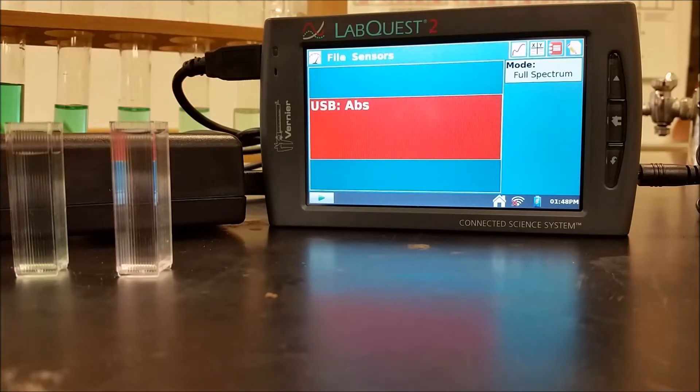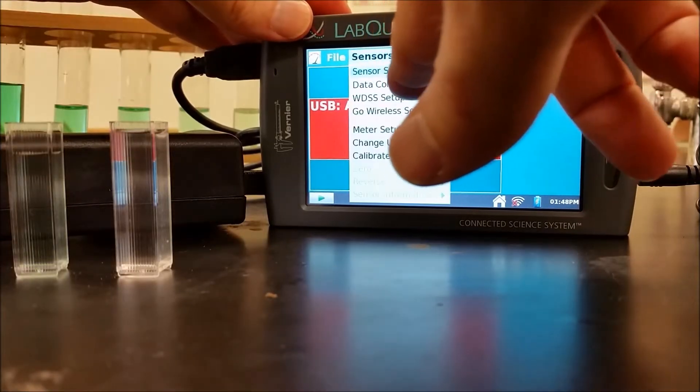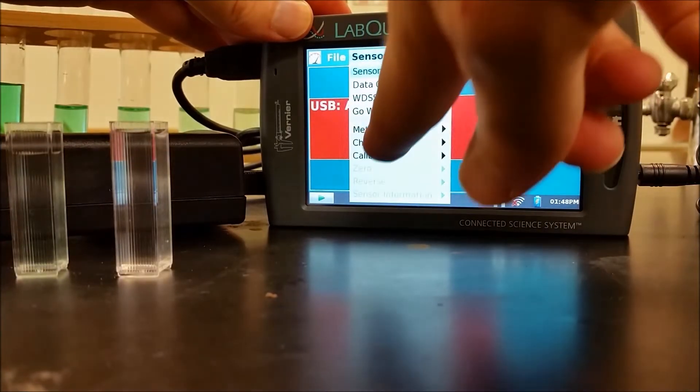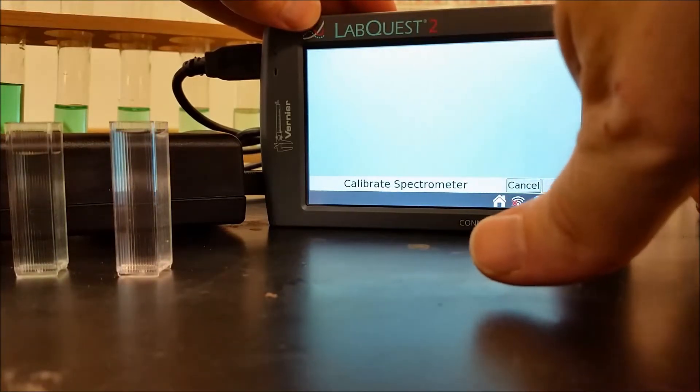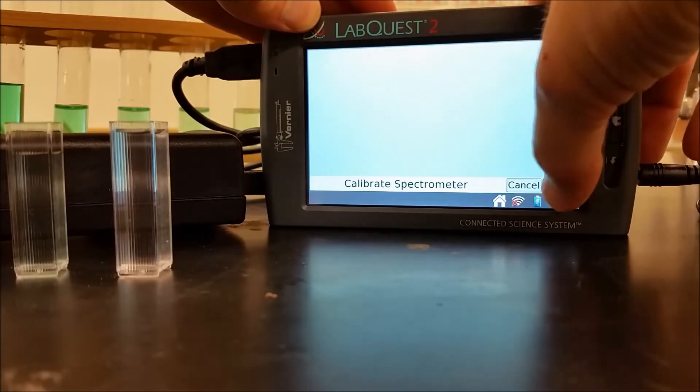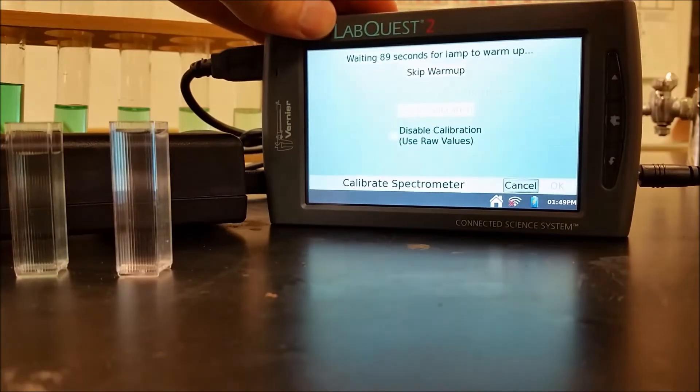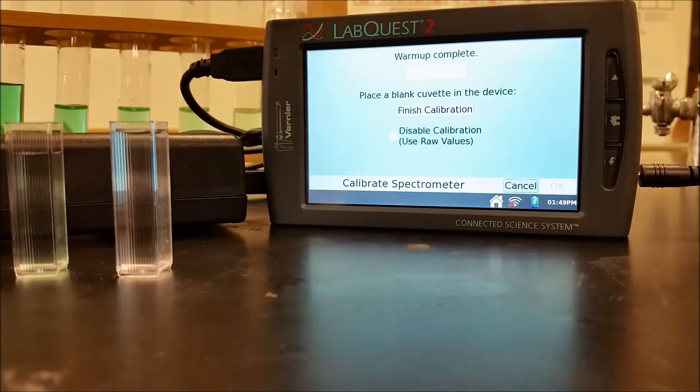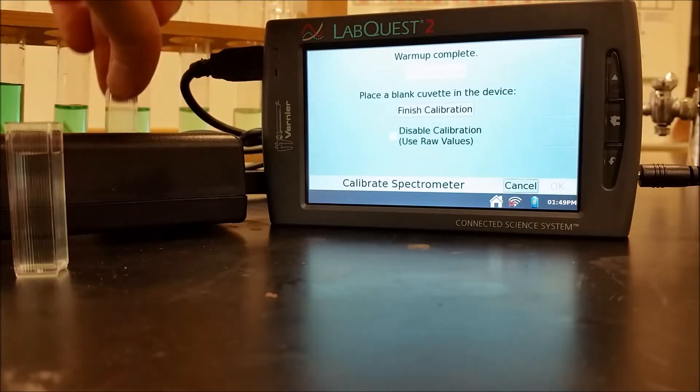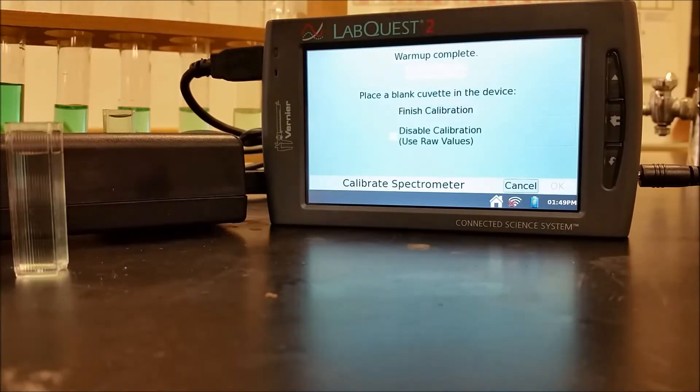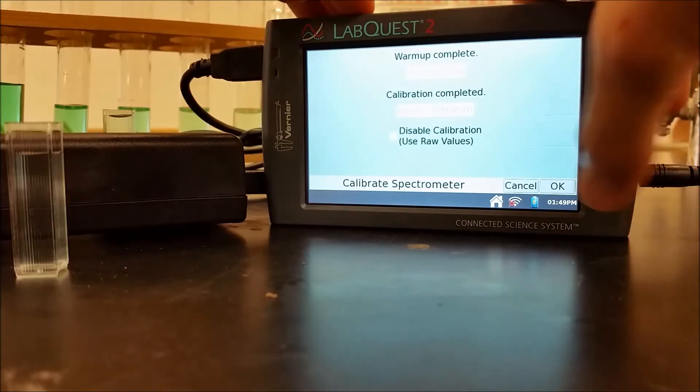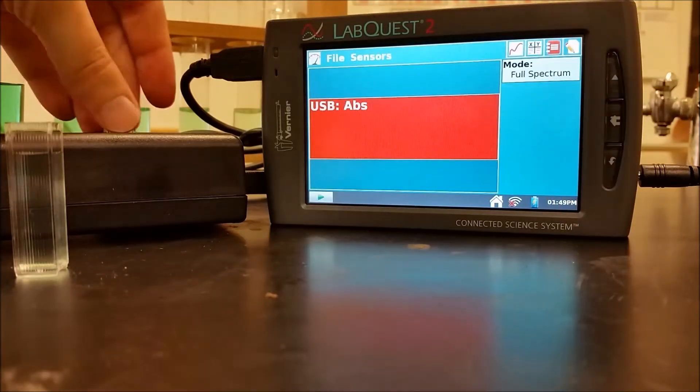So here's our setup. First what I would do is I would go to Sensors, and then click on Calibrate, and then calibrate my spectrophotometer. That just involves letting this warm up, which I have already done. So I'm going to skip that, and then I'm going to put my distilled water in here and hit Finish Calibration. And then that's going to set a background here to how much light gets absorbed just by the cuvette itself and the distilled water at all the different wavelengths. And then I go ahead and hit OK, and now I'm set to start.